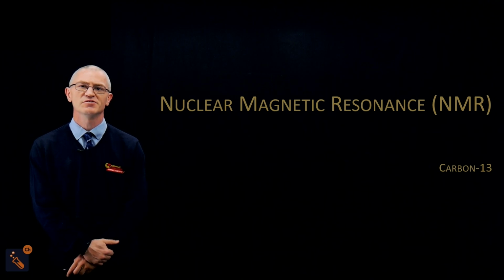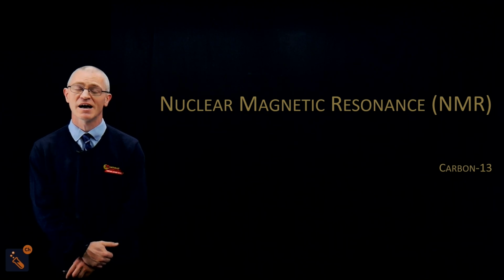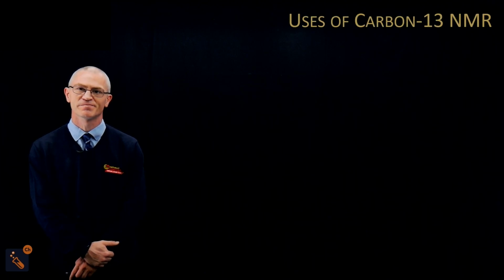In this video, we're going to talk about nuclear magnetic resonance, specifically carbon-13. We're going to go over some examples of carbon-13 NMR and how you analyse them. This will also be followed by an exam-style questions video, which takes you through some specific examples of how you can be asked questions in the exam. So, uses of carbon-13 NMR.